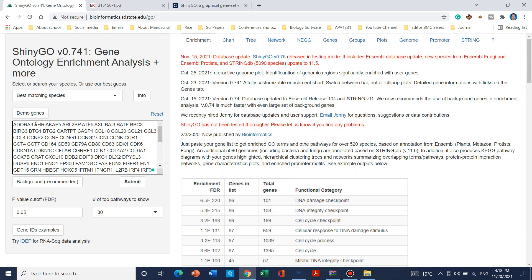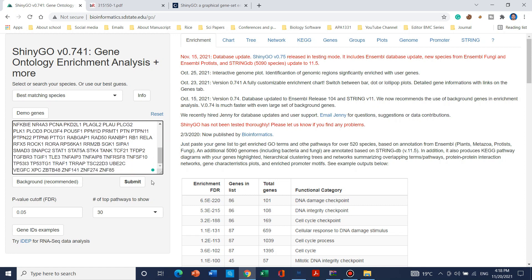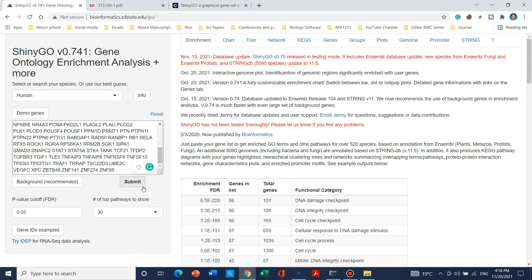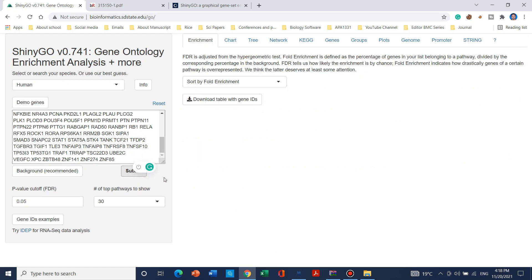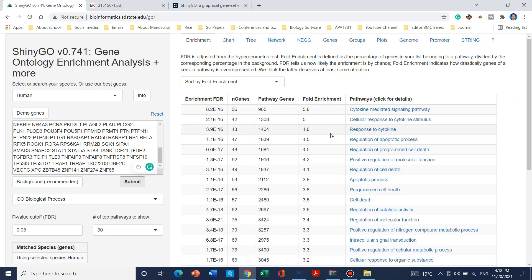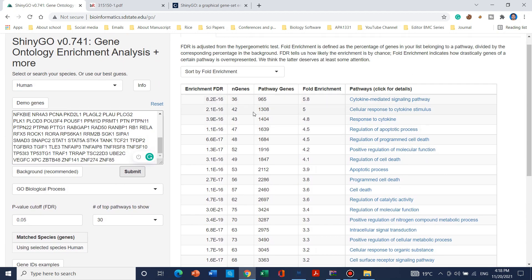After pasting your gene IDs — note that in each ID there is a gap before starting the next ID — I have pasted 147 genes. Before clicking Submit, I should select the species, which is Human in this case. When I click Submit, it will convert the gene IDs into a tabular form. We can now see that all these genes have been changed to a tabular form.